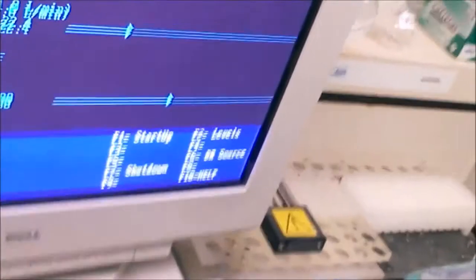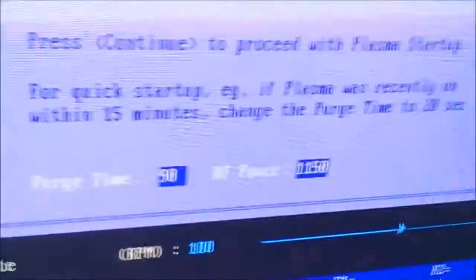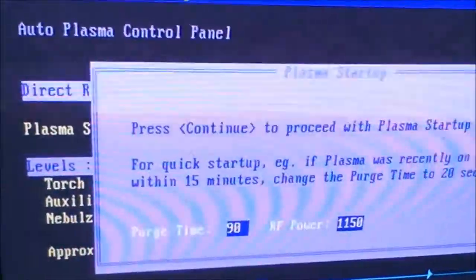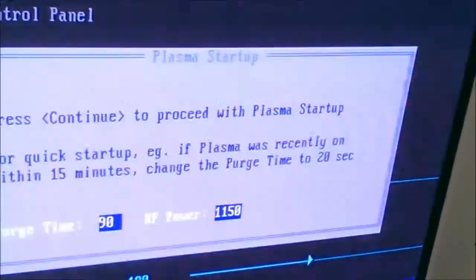Remember not to burn the ICP dry — you're always going to want to run it with liquid. So now we can click F1 startup. If we click F1, it'll come up like this — it's asking if we really want to proceed with the startup. And we do, so we press F9 to continue. Now it's purging with argon and starting up.